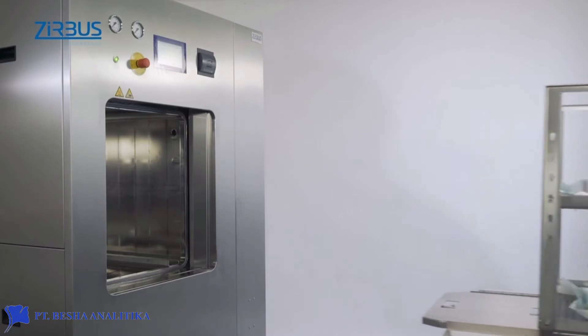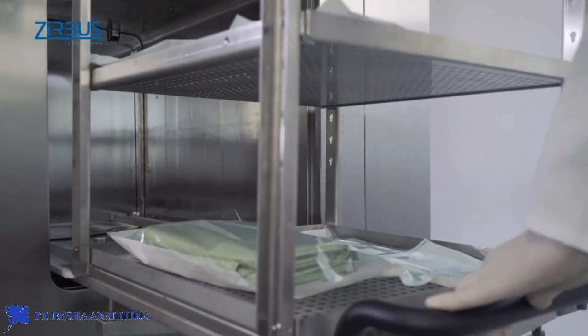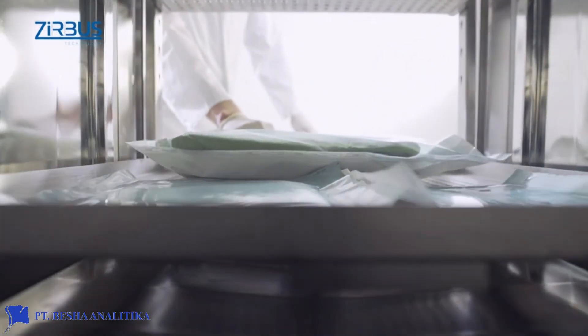Transport and loading carts are used for loading and unloading the instrument. The heights of the shelves can be adjusted for more flexible handling, and the transport cart can also be securely docked onto the chamber.